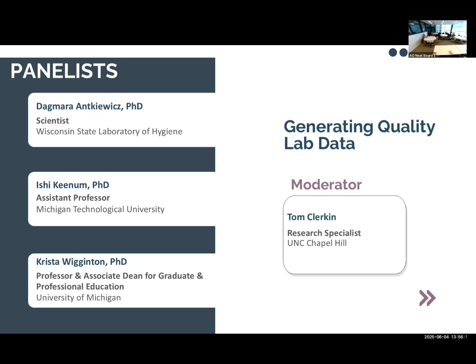Yeah, I think there's a lot of different ways you could go with it. I do see, especially if you're thinking like Eurofins or a company that's trying to run many, many different labs, and they have internal QA QC across labs, and the idea that every lab could handle every different thing, I get where you're coming from, but I also think that in the meantime, people have done a really good job, and it really starts with knowing your variability.